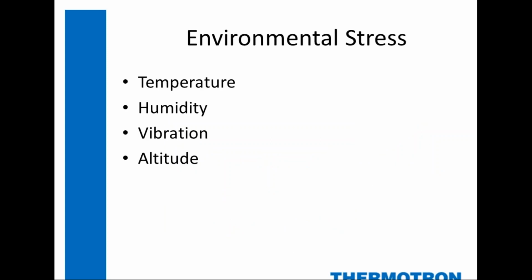So those are some of the reasons why people test, and I'm going to spend a little bit of time going through different environmental stresses. The most common ones we see here are temperature, humidity, vibration, and altitude.